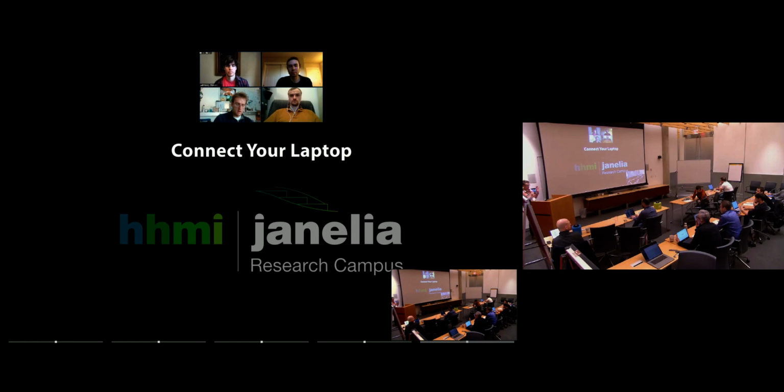So we're not talking about fast timing, but about different kinds of chemistry that happens in different rounds, different labeling and imaging steps over 24 hours or more while no one's there. So it's a platform that works reasonably well to do that. We do use Micro-Manager under the hood, mostly for the sake of the drivers.